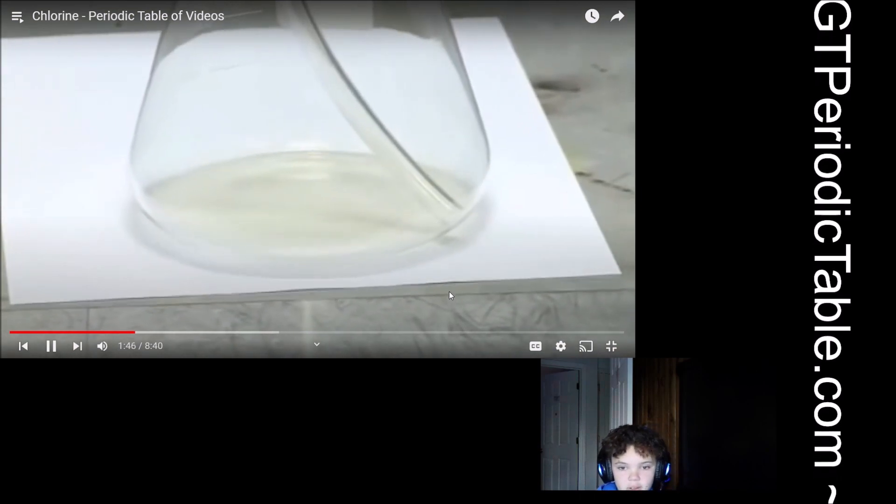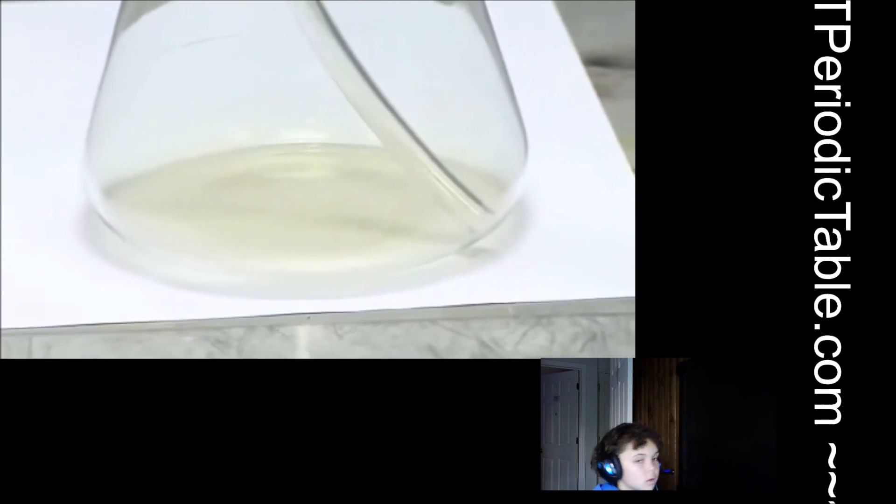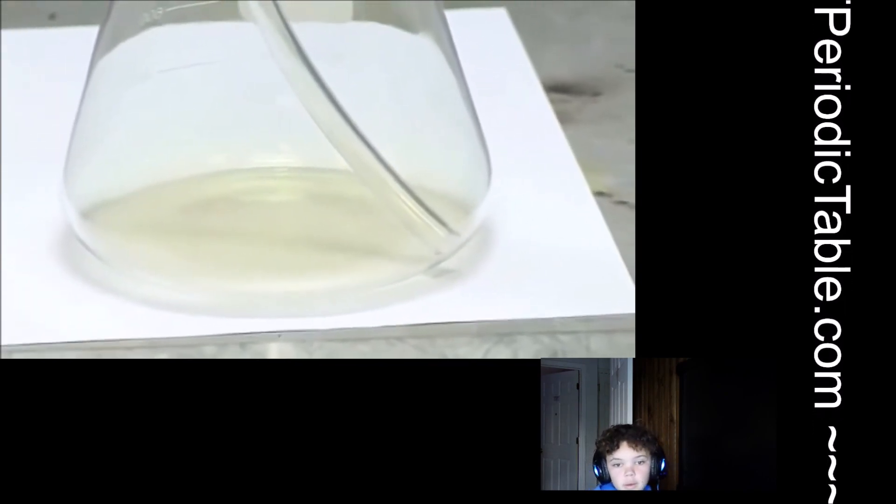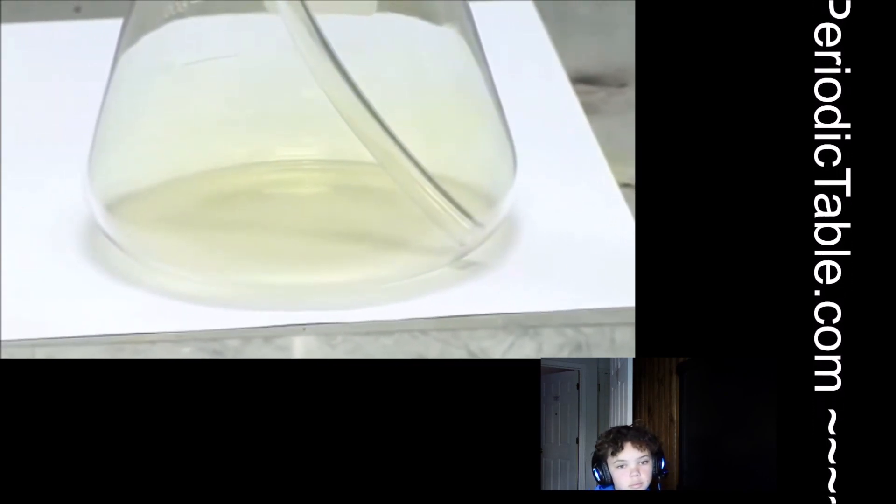You can see the yellow colour against the white background on the paper. So now we're starting to fill that flask with Chlorine. It's quite dense, so it will stick to the bottom of the flask. It's not like a light gas like hydrogen or helium. It won't come upwards. So now you can see the colour in that Chlorine is really quite intense.